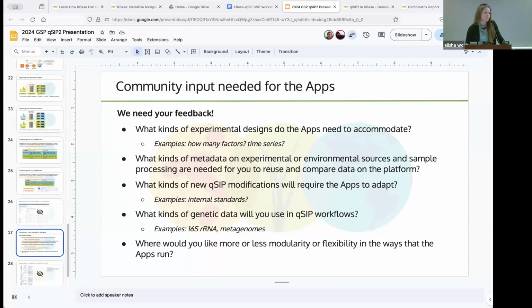Any other thoughts or questions around this? So Jeff also is working actively with the JGI staff as well. They are releasing quantitative probing analysis for metagenomes. And so we will be adapting this to the JGI outputs and to their spike-in standards, like you said. And so we'll have to adjust for that as well. So this is an evolving process. And if you want to get your experimental requests in, now's the time to do it.